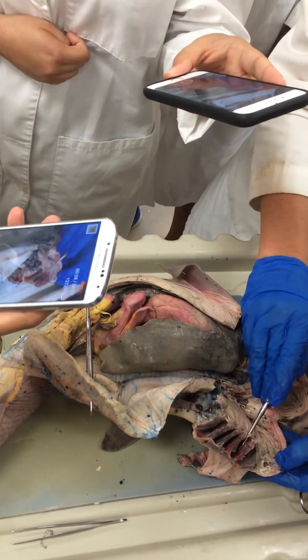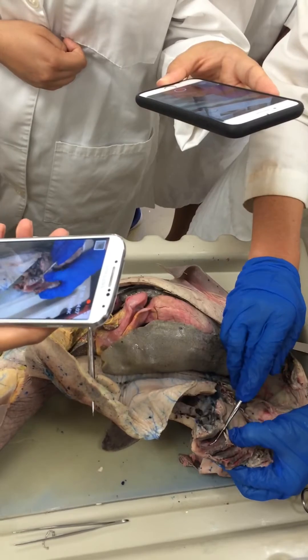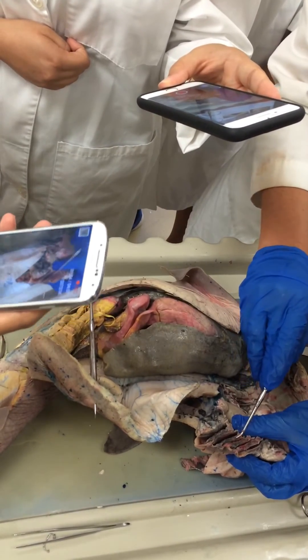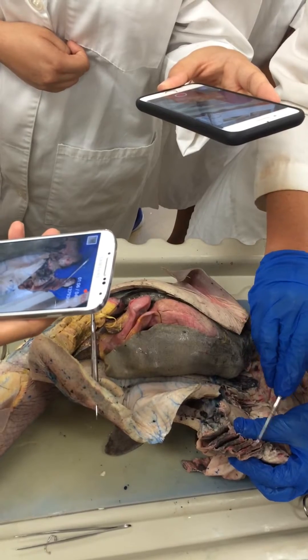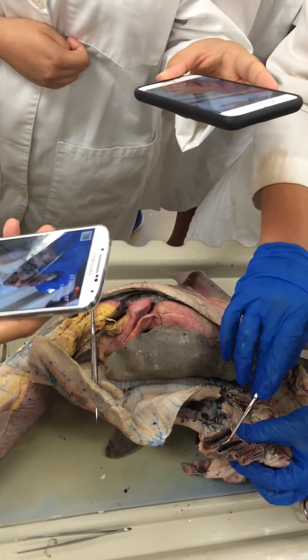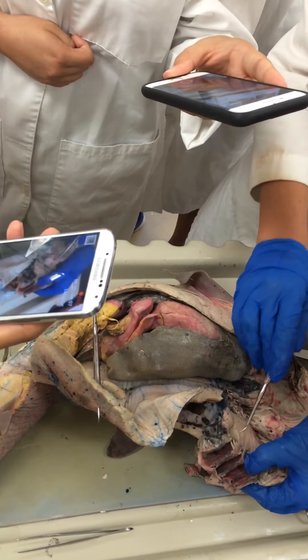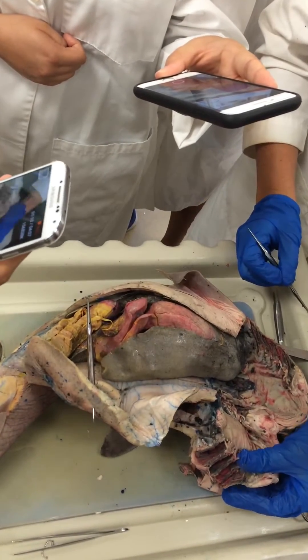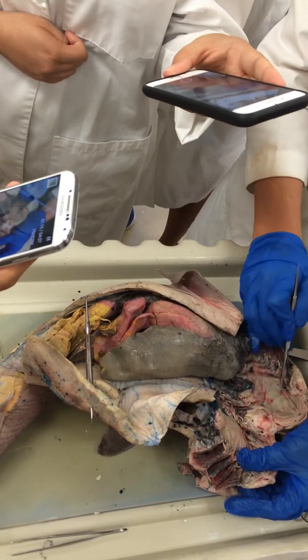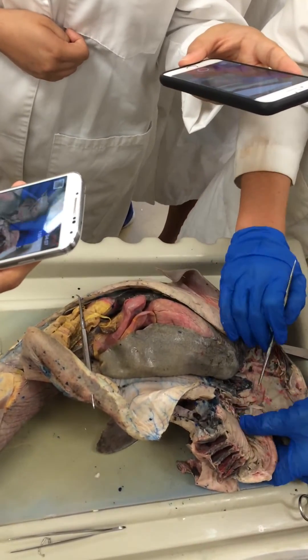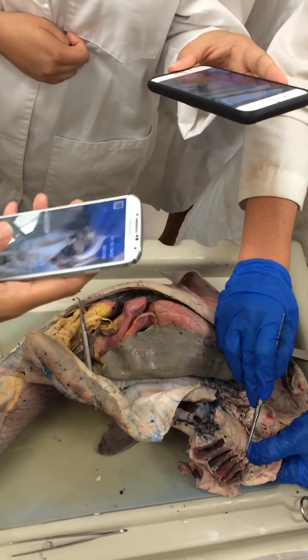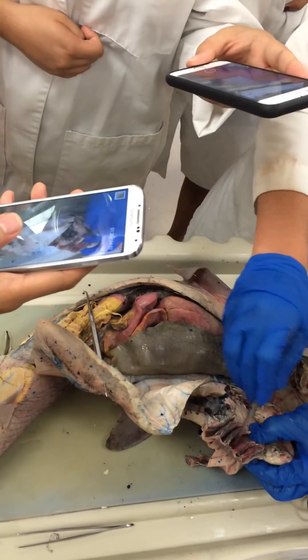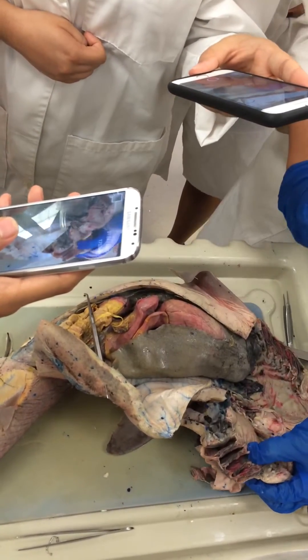These are the parabranchial gill chambers with gill filaments, and the septum between each one separating them is called an interbranchial septum. The muscle part of that is the interbranchial muscle. And then these are the gill rakers. We have the internal part of the spiracle here, and these are considered the internal gill slits, whereas the space in here is a parabranchial gill chamber.